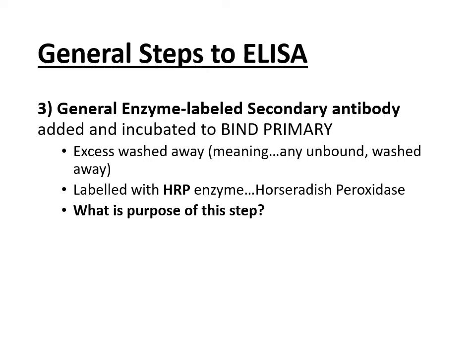So the secondary antibody in an ELISA is very important because this will bind to any of the primary complexes of the infected patient's samples, and it will have a form of detection on it. Okay, so remember those two important aspects of it. It binds primary antibody, or the patient sample antibody, and it has a detection on it.